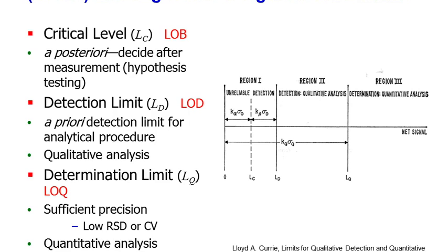If you have too much of it, you can always dilute it and run it. But if you have too little, it's very hard to increase the levels to make it measurable on a mass spectrometer. So I'm going to be talking mostly about lower limits in signal measurement. So there are 3 limits people usually calculate.